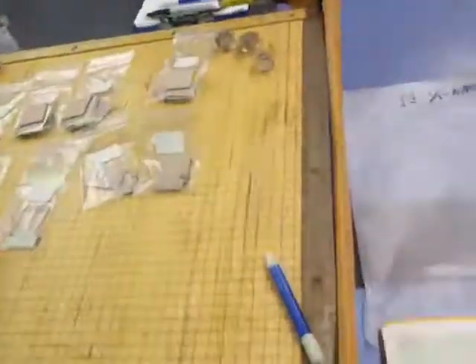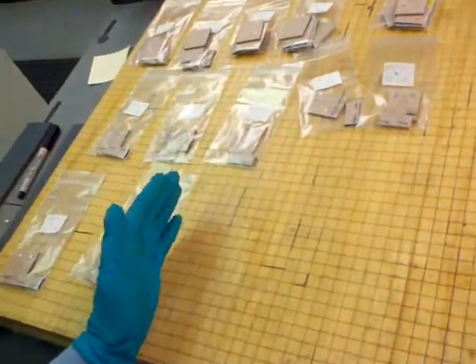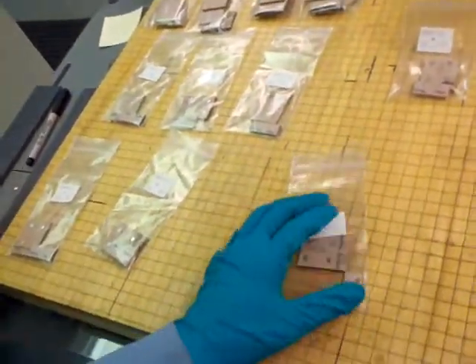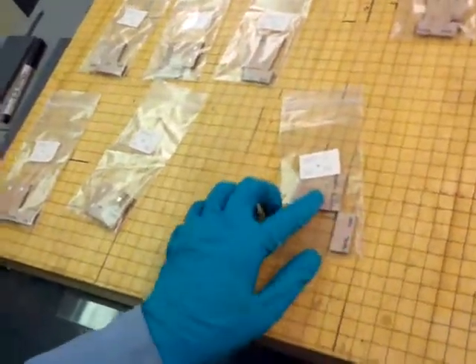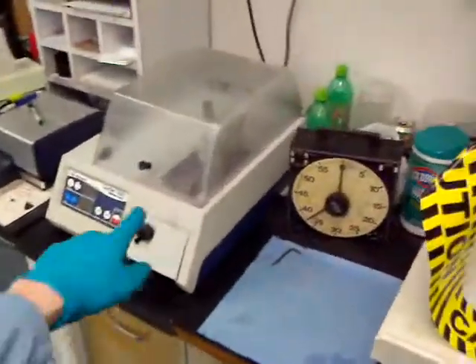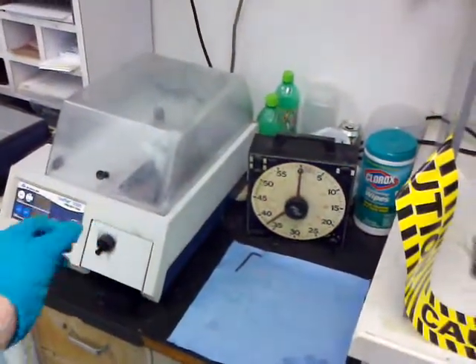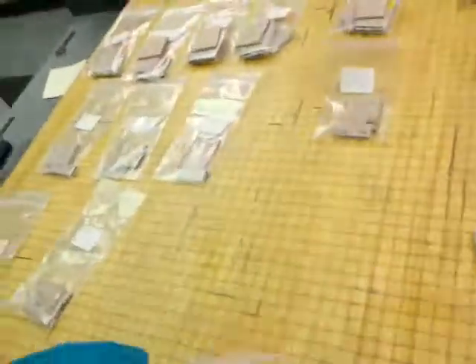So right now I'm cross-sectioning all these boards. There was a board about this size, maybe from here to here, and it had about 20 or 25 tiles, and each one of these represents a tile. They're labeled, and then we have other labeling. I've had to make a few cuts — there's a diamond saw over here, basically a copper blade with diamond impregnated in it to cut through these circuit boards, which is what they are.